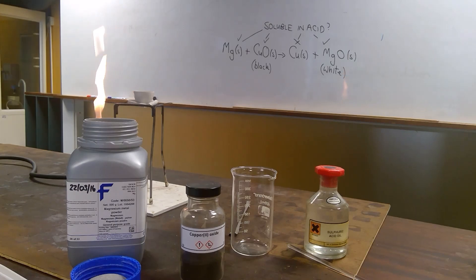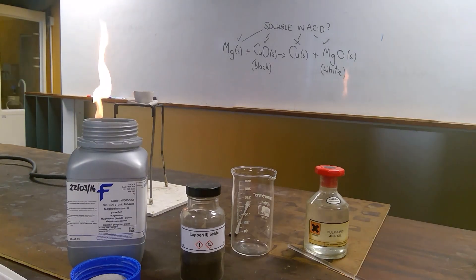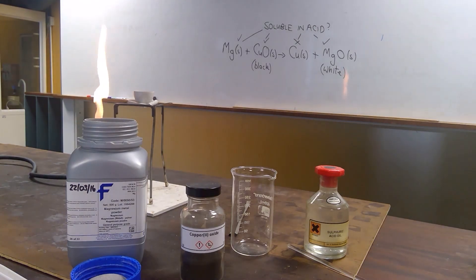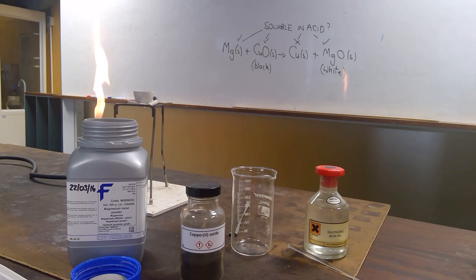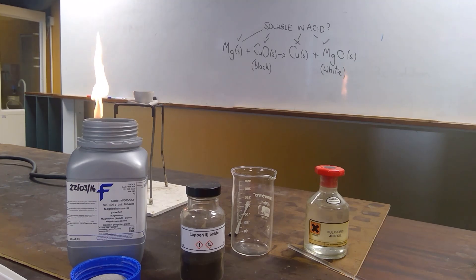The magnesium is higher in the reactivity series and reacts with the copper oxide to displace the copper. The magnesium becomes magnesium oxide, which is a white powder, and the copper oxide, the black powder, becomes copper, which is the red-brown copper-coloured solid.